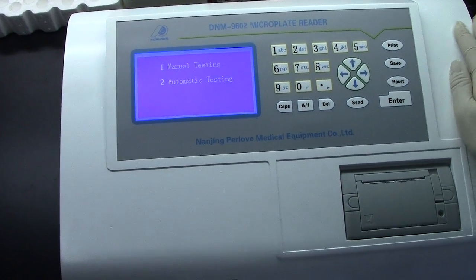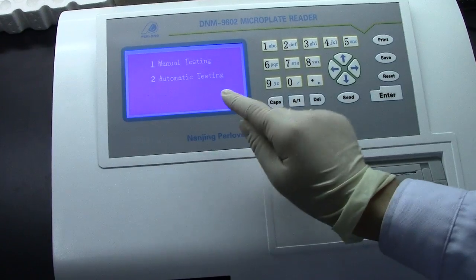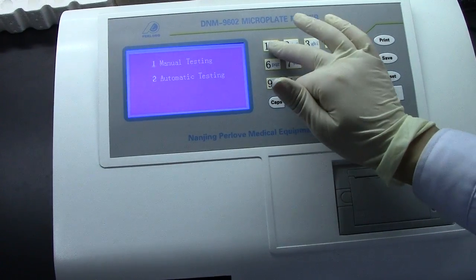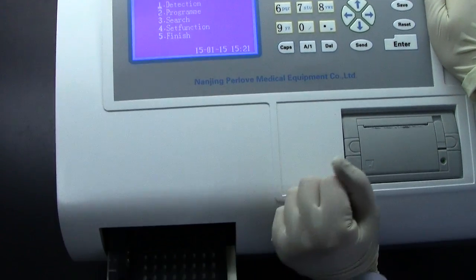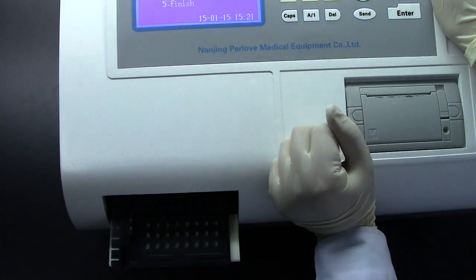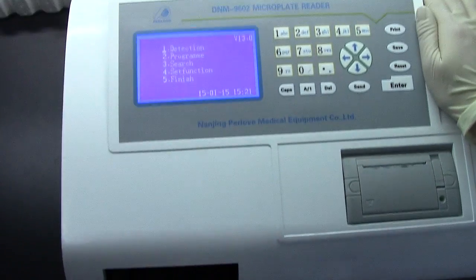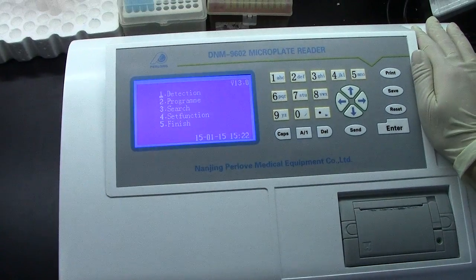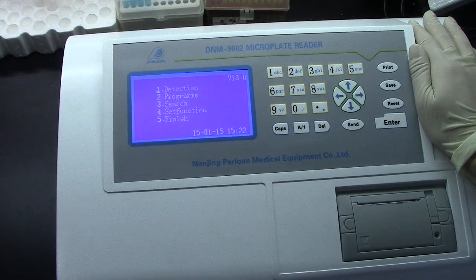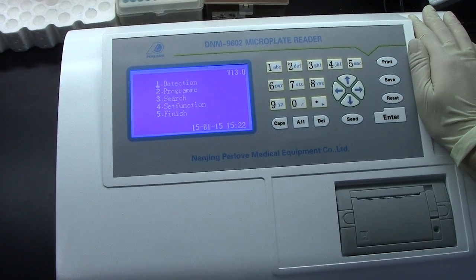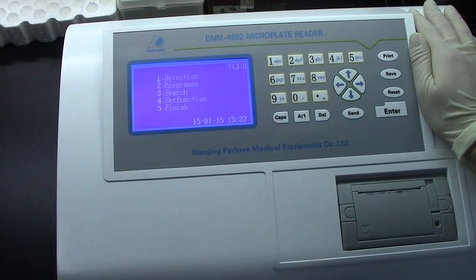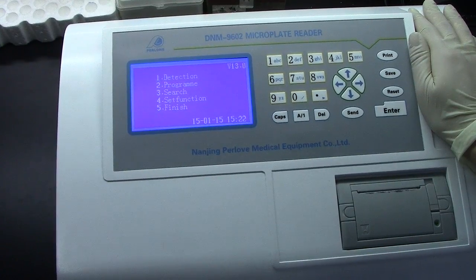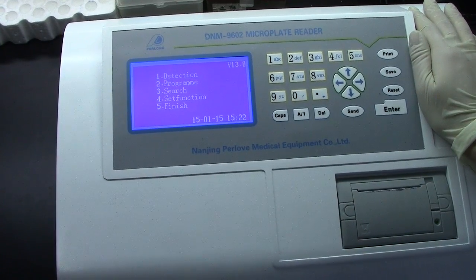We always use manual testing — press 1. It is the main manual: 1. Detection, 2. Program, 3. Search, 4. Set Function, 5. Finish.